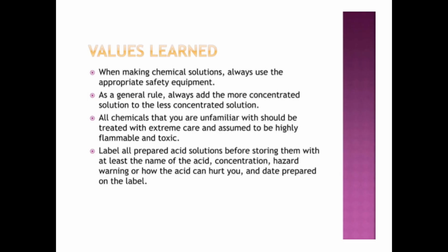So by the time you are done with preparing, please ensure that whether it is acid or base, any solution you have prepared and transferred from the volumetric flask to the reagent bottles, make sure that before storing them, you put the name of the acid. For instance, put H2SO4 if it's H2SO4 that you have prepared, and then put the concentration. Maybe you prepared 3 molar H2SO4. You put the hazard or warning sign.